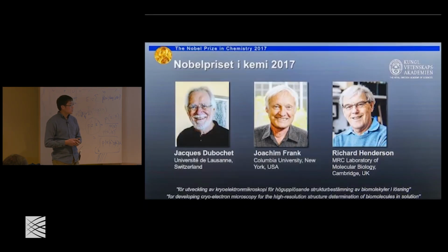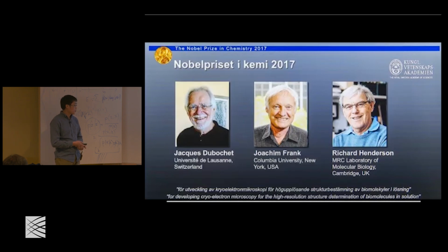In 2017, the Nobel Prize was awarded to three scientists who made significant contributions to cryo-EM for high-resolution structure determination of biomolecules in solution. Essentially, these several words actually define the technique of single particle.